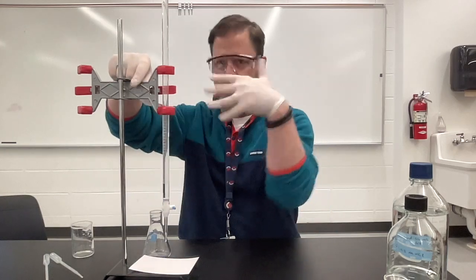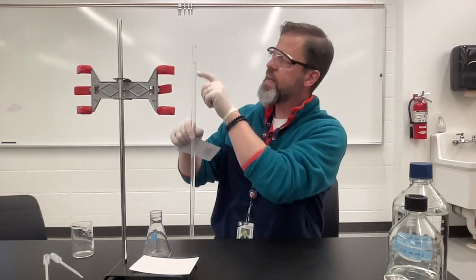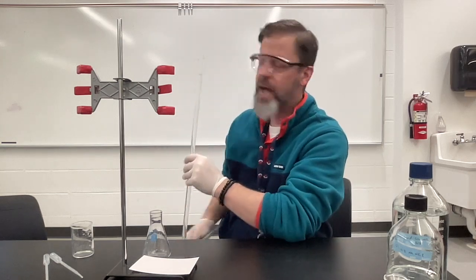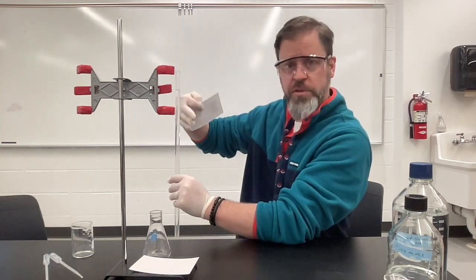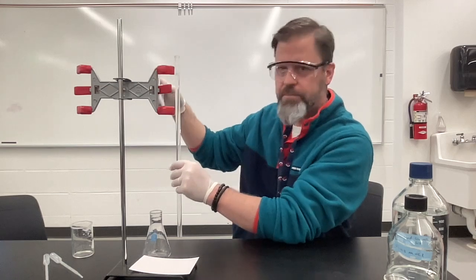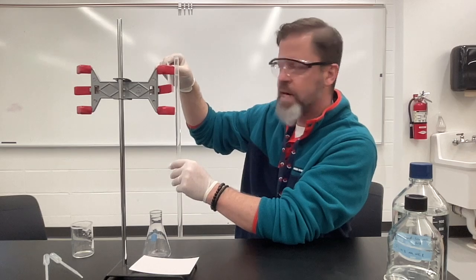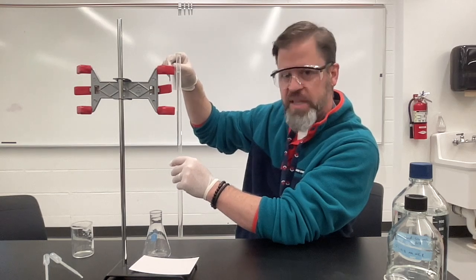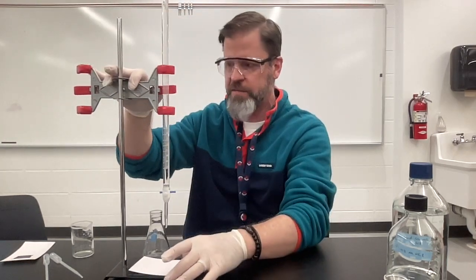You're going to have a little trouble seeing this — imagine that this is still clamped in here. The number readings start at zero up at the top, and the numbers get larger as you go down, so make sure you're calibrated to that. I also have a black surface here, which can help you get a good reading. What I would do is get my initial reading at the bottom of the meniscus — that curved part of the solution. Remember, you can always measure one digit better than the minor scale division.